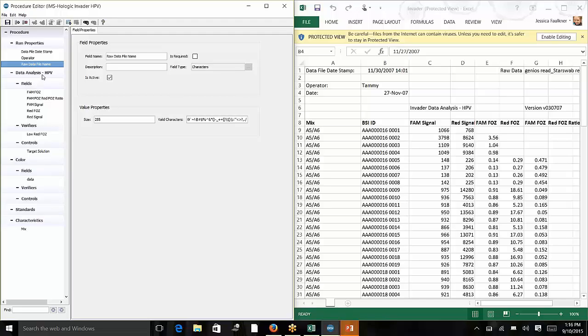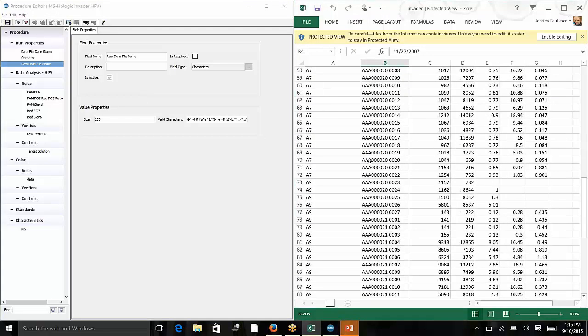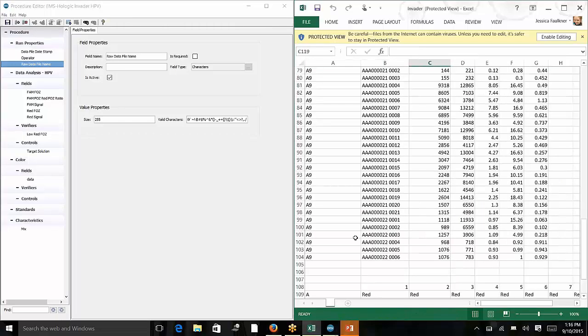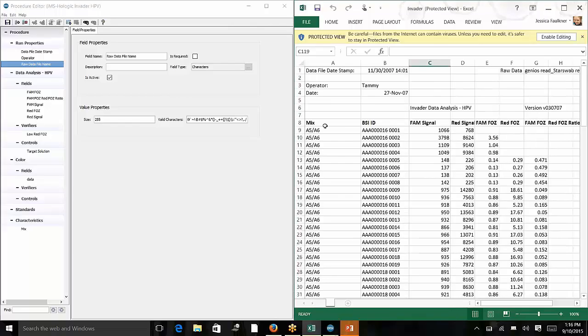So you can set different data tables. This particular file has 2 tables in it. Full disclosure, I added this one on my own just so we could have an example of both. So there's 2 different data types or data tables that can be handled through the results batch or the procedure.